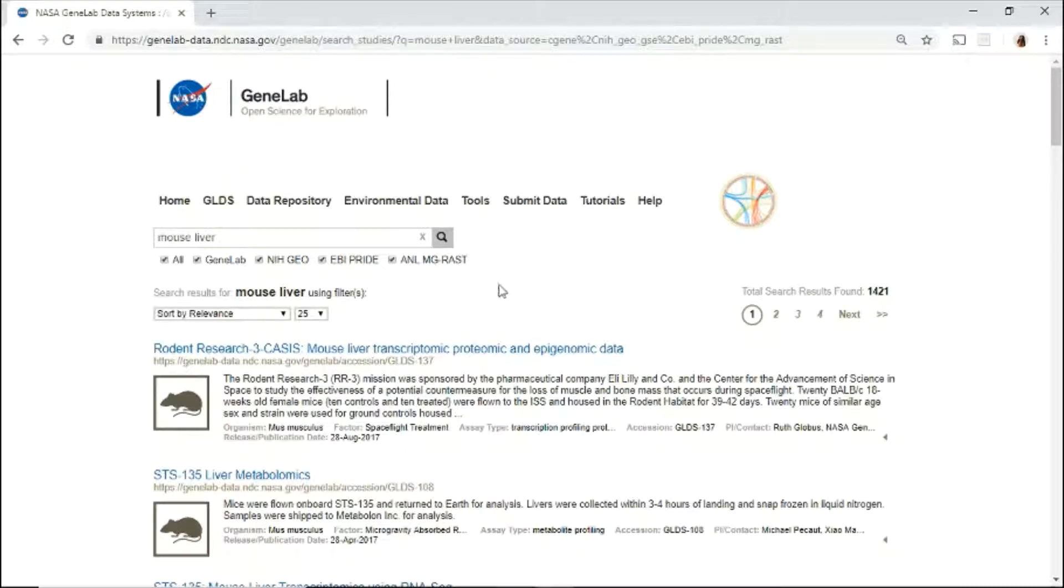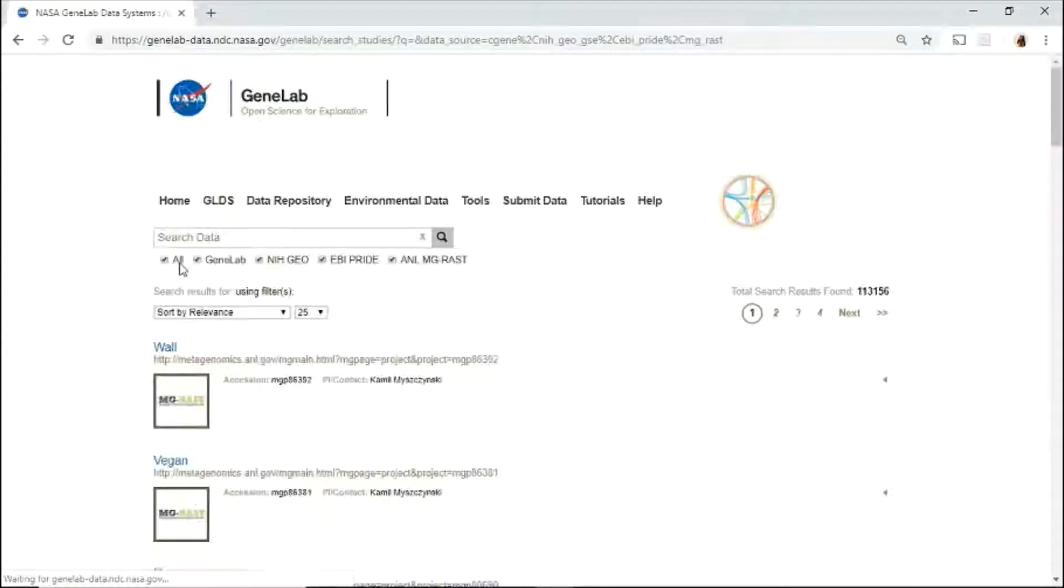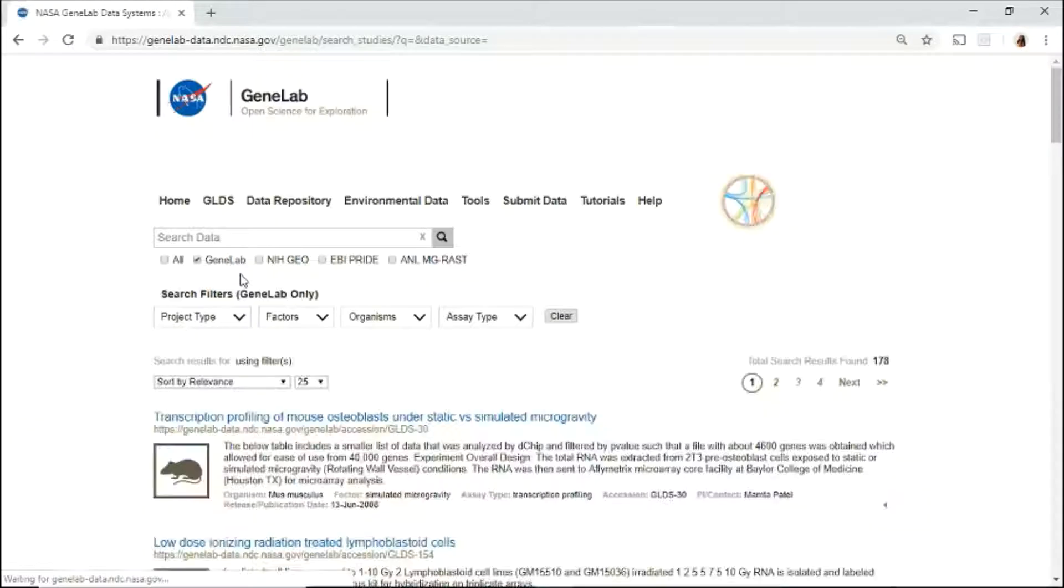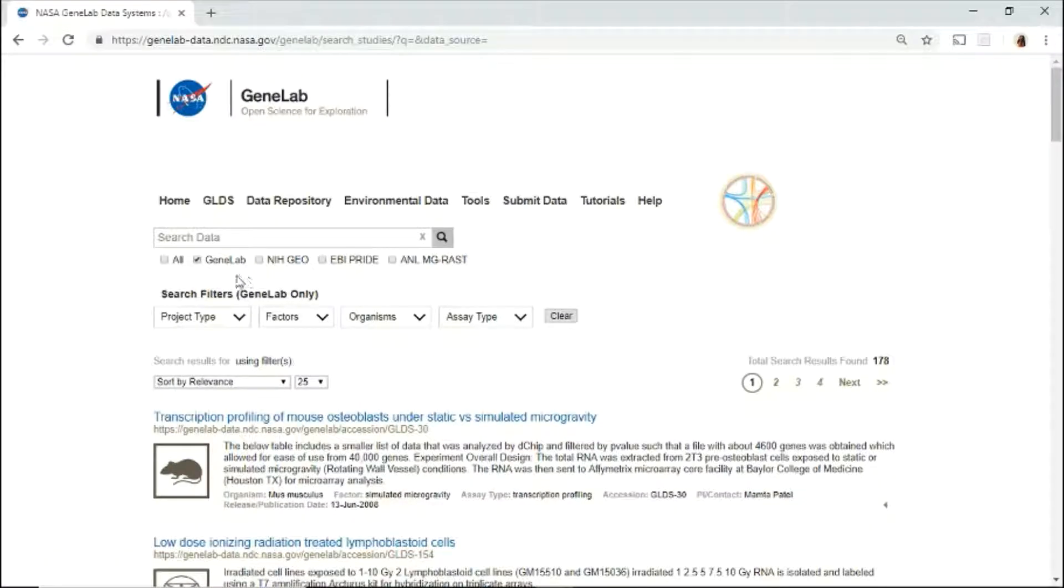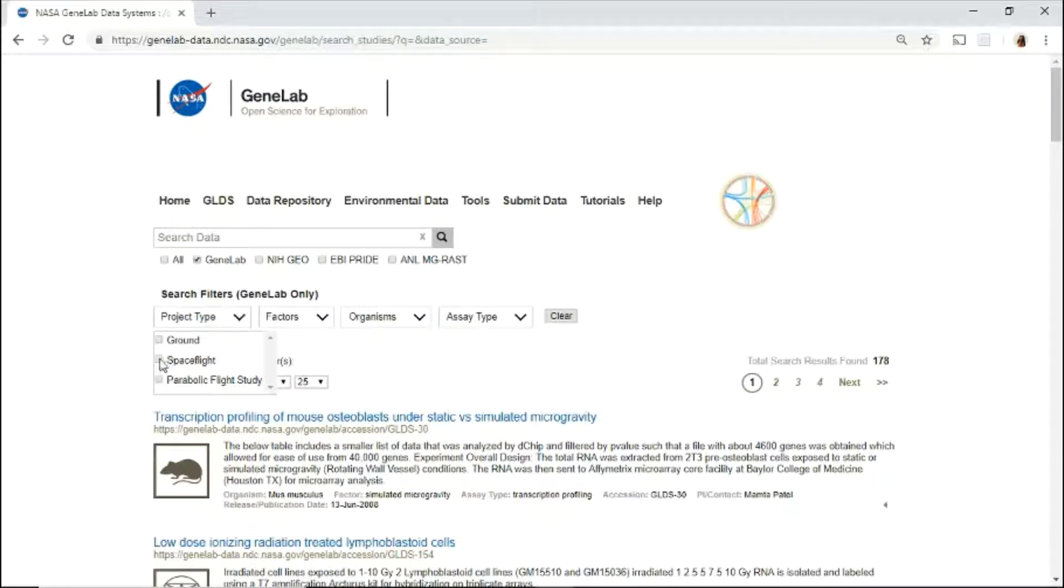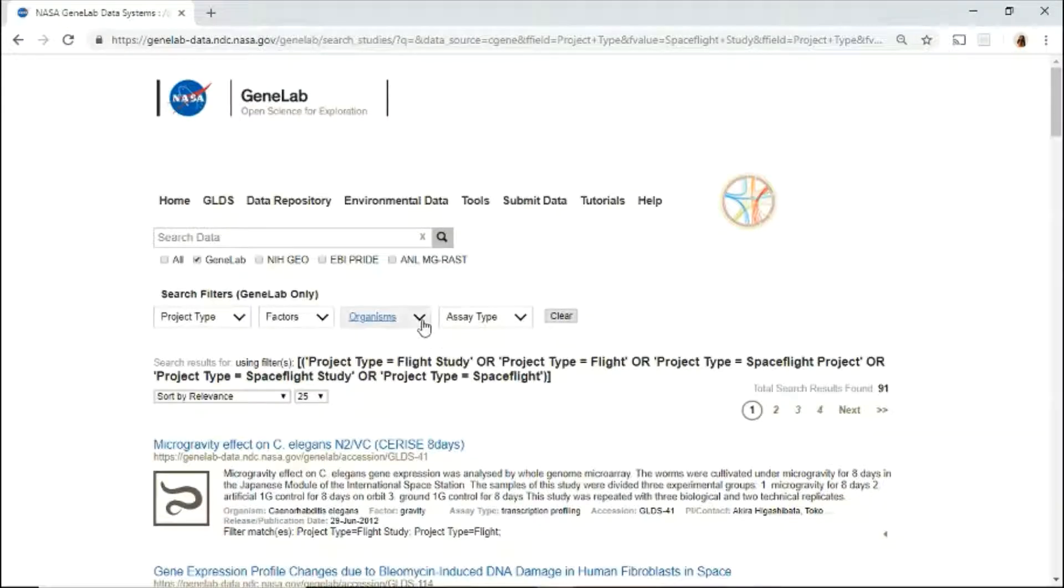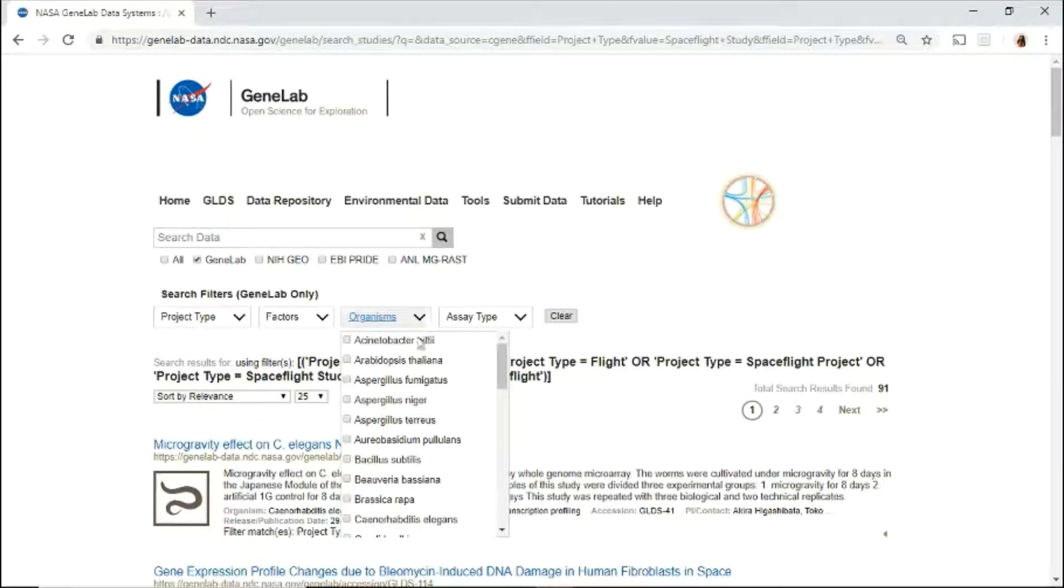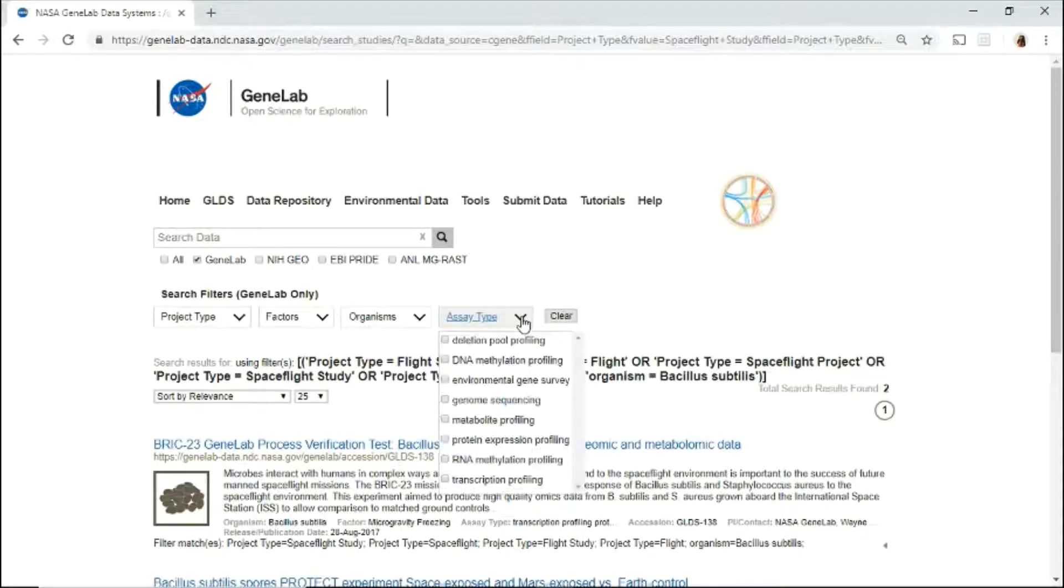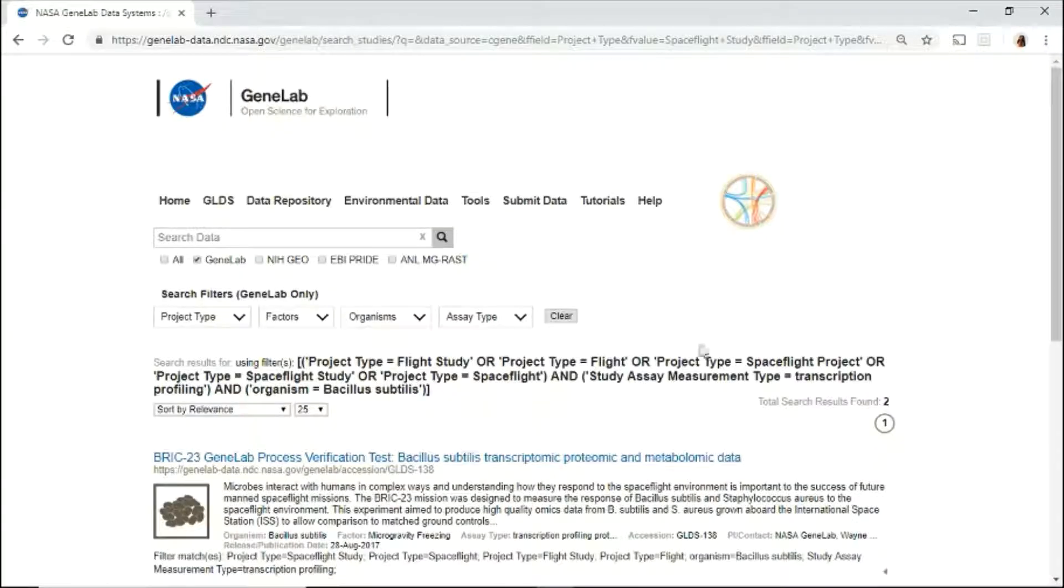To search using the filters, clear your previous search and only have GeneLab checked. Use the filters to search through the different fields. Let's search for spaceflight under project type, under organism, Bacillus subtilis, and assay type, transcription profiling.